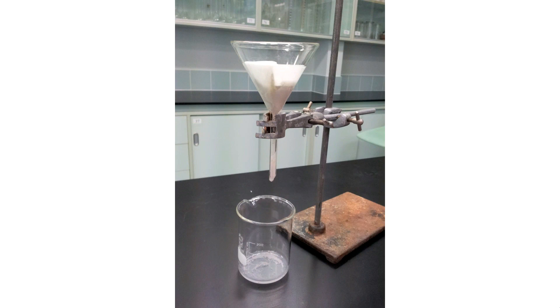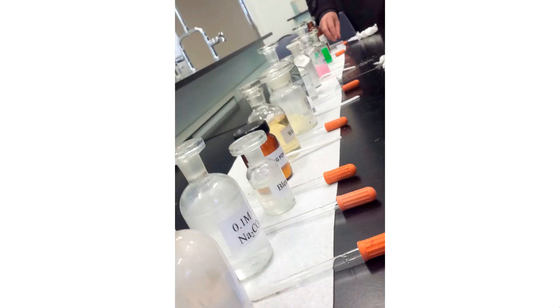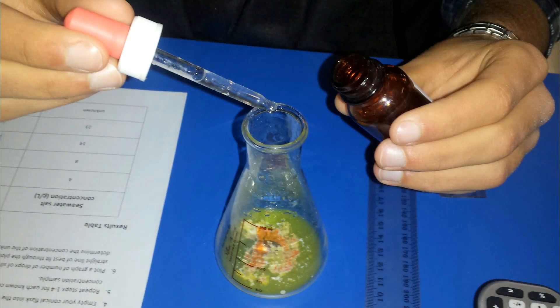Here is a Pasteur pipette, sometimes called an eyedropper — this is a little plastic one. You also get glass versions with little rubber stoppers, and you can get them as part of a dropper bottle — you unscrew the lid and the dropper is actually part of the lid.